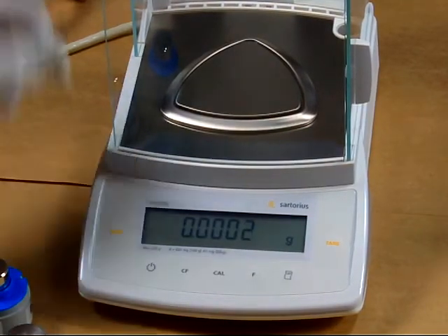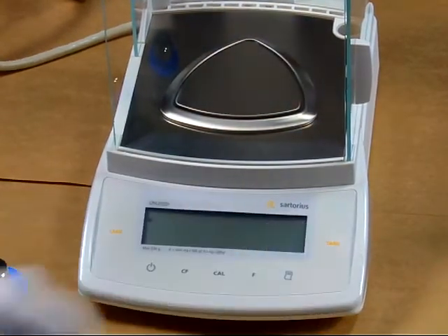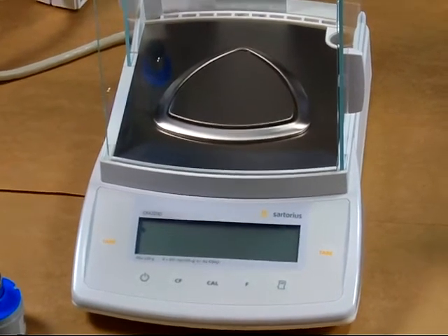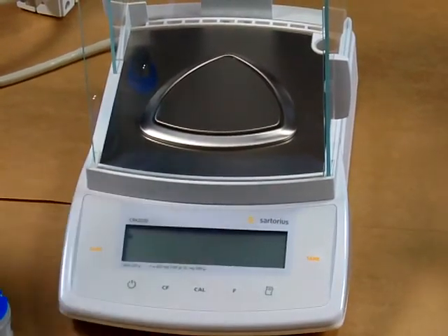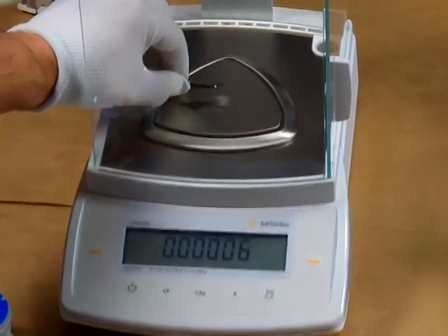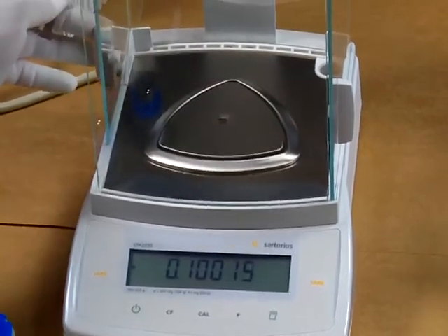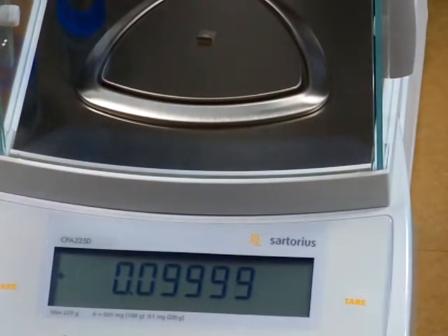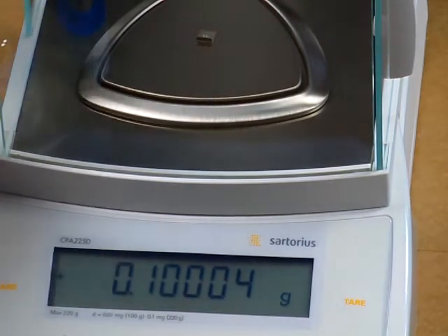We also have here a 100 milligram test weight — this is ultra class. And there you go, spectacular performance.